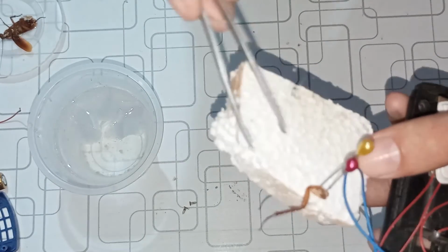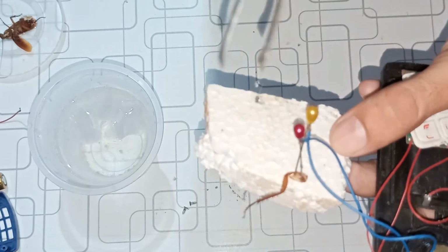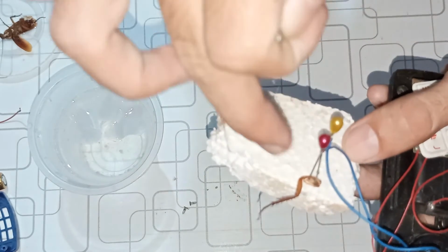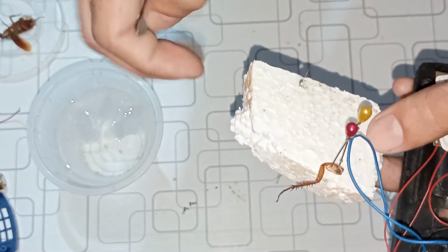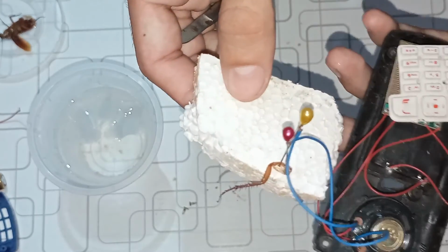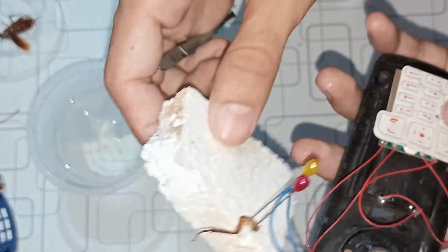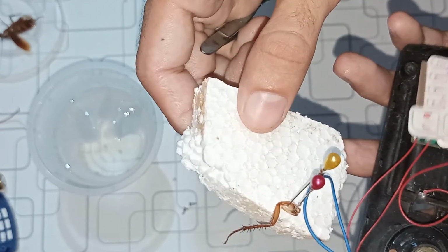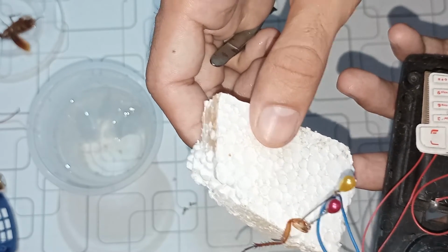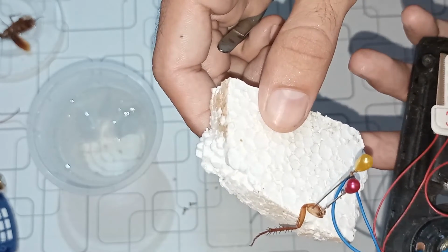I am exciting the neurons by changing the frequency between them. I inserted two electrodes over there, as you can see. So I am exciting the neurons, and as a result it starts moving. Let me play the other song. As you can see, I'm exciting these spikes, and it is working.